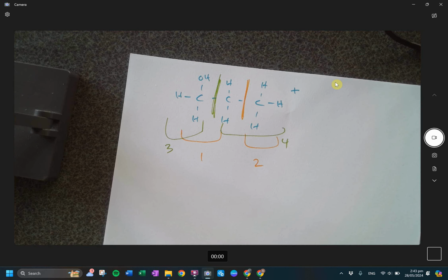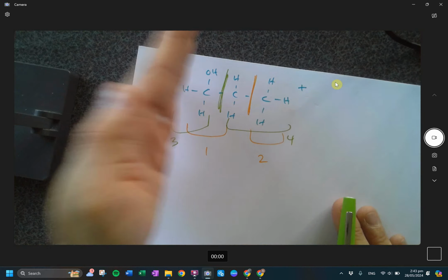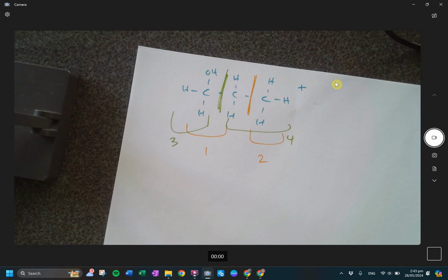When these molecules break apart, one half becomes charged and carries that charge. The other half is uncharged because it's only lost 1 electron. So half becomes charged, half becomes uncharged. Are you okay with that so far? So basically, I chop up this molecule and I have lots of different pieces.